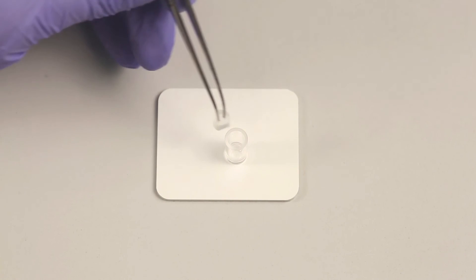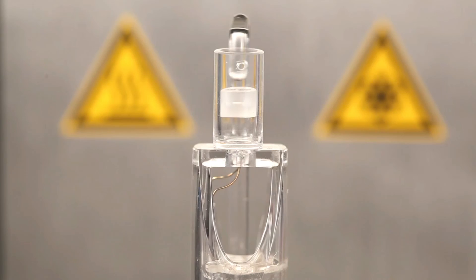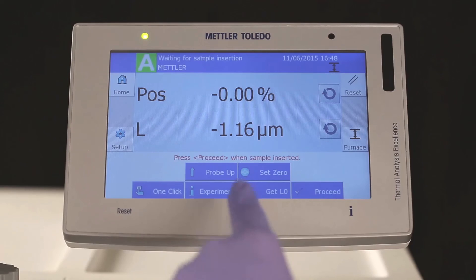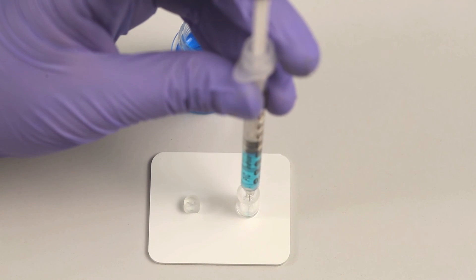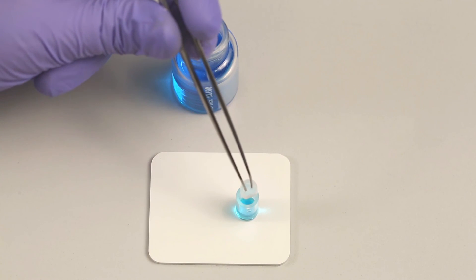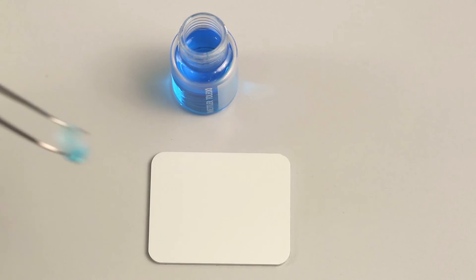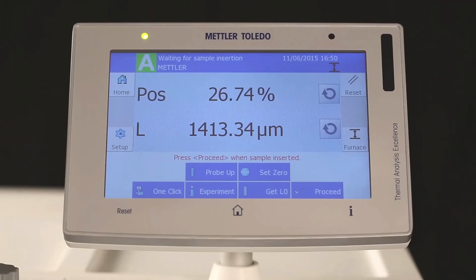Insert the piston into the volumetric tool. Take care that the cut edge of the piston aligns with the hole on the top of the cup in order to make overflow possible. Place the empty volumetric tool with piston onto the sample support. Lift down the probe and set 0 in the TMA. Remove the piston, fill the volumetric tool around half with the help of a syringe, then reinsert the piston until it is in contact with the liquid and insert it into the TMA. Press GET L0 to get the initial length transferred to STARe software and start the experiment. Note that a very small force should be used in the method, which is 10 to 20 milliNewton.